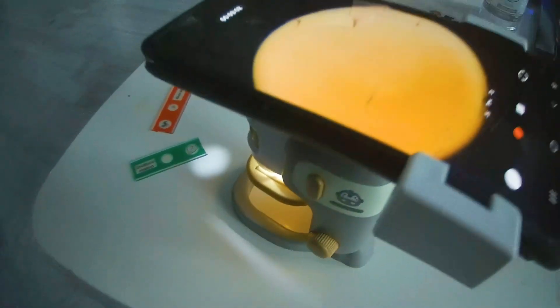Now, in addition to the microscope and the phone mount, you also get pre-made slides to immediately put into your microscope and see. So you got shrimp legs, you have corn whiskers, fly legs, onion, duck feathers, you have bee wings, deciduous venation which is a leaf, fish scales, moss, dandelion fluff, and sage.